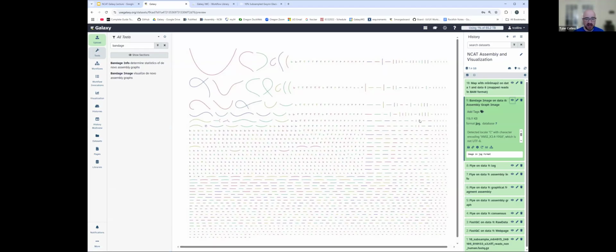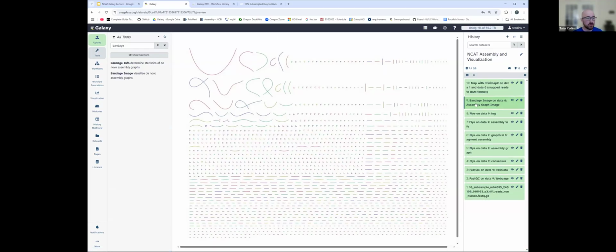So with this assembly graph, we might think, well, let's also try and visualize our coverage. Let's try and take a look, and if we want to see our contigs, how many reads actually map to those contigs? What do those actually look like? Does it make sense? Is there something wrong? More sanity checks. So to do that, we're going to use IGV, which is a nice genome viewer. I'm assuming most people are familiar with it, or if not, it is a very common way to investigate visually how a genome is structured.